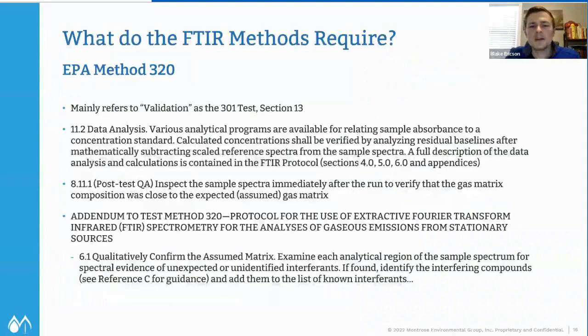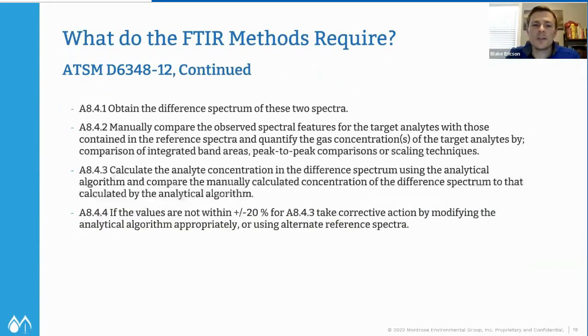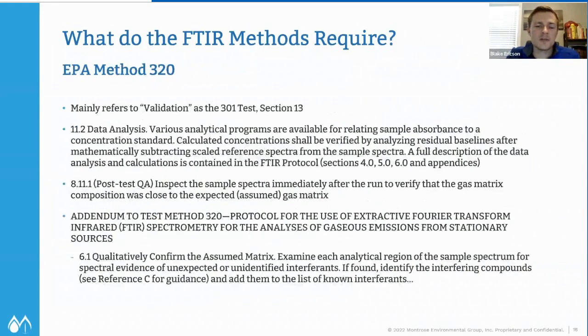So these three slides are basically what these are all saying. These are actually from the methodology, whether it's Method 320 or ASTM D6348. Just so you can glance over them, it basically says that validation is a must. There's no way around it. It's in the methodology. For some reason, I think it's gone to the wayside for some firms, but it's literally there.